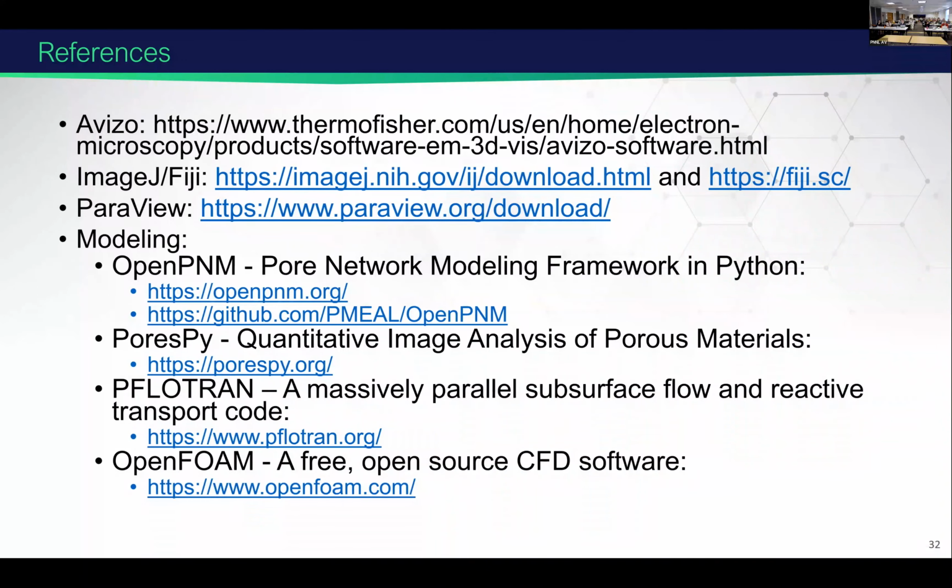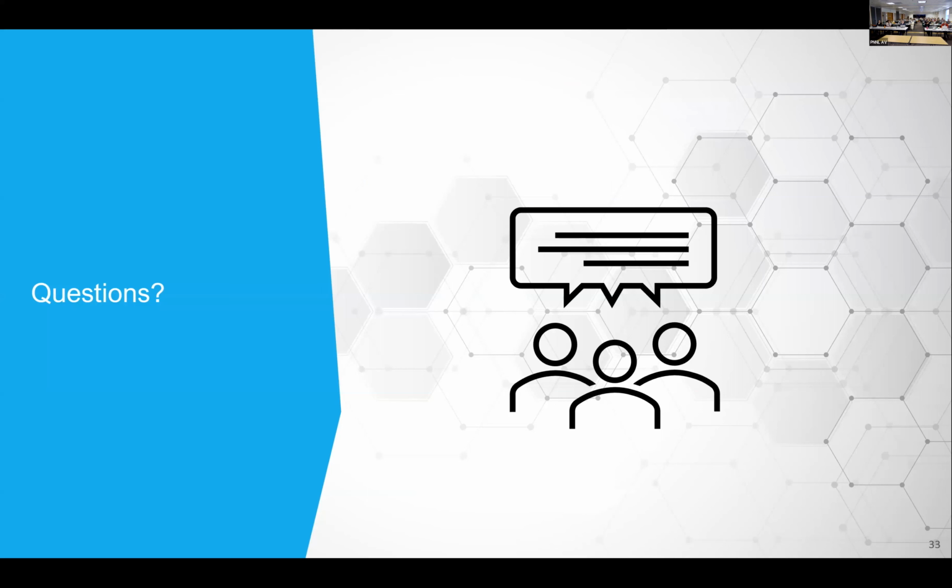Links to the software tools. ImageJ Fiji will be featured tomorrow in the hands-on tutorial, as well as PFLOTRAN and OpenFOAM that Maruti just talked about. So you will get a chance to try to use those tomorrow. And I think with that, we were pretty quick, but we're happy to answer some questions. I have some extra slides if there are questions, but a lot of these will be covered tomorrow in the hands-on tutorial.